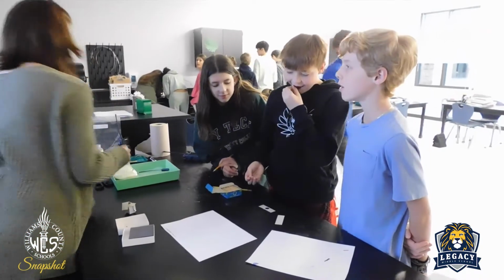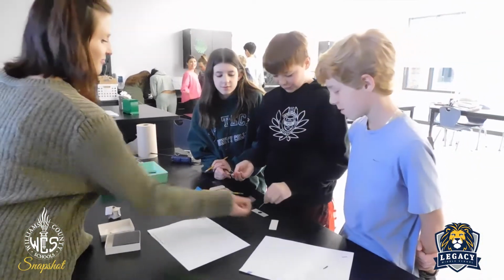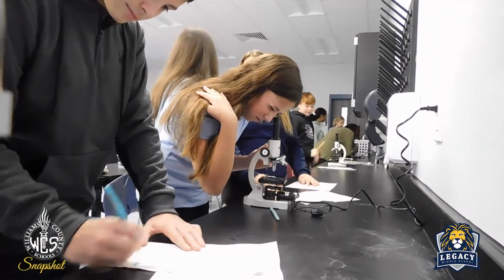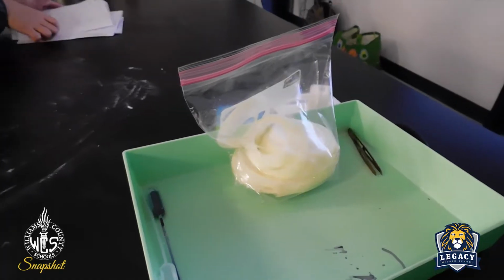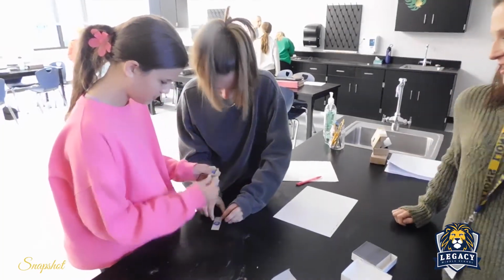We got to rub a little stick against our cheek to get a cheek cell, and then we put that against a microscope, and you could see all the tiny little organelles that make up your face. We also looked at an onion because we cut off a piece of the onion and put it under a microscope and got to look at that. I thought it was just a cell, but there were all different types of stuff inside of it.